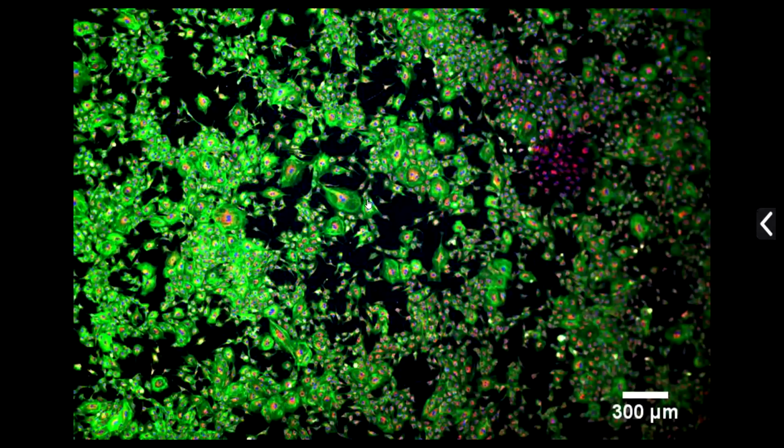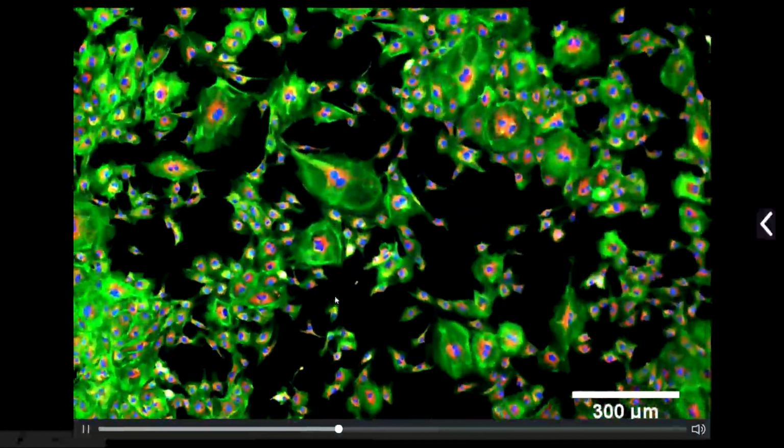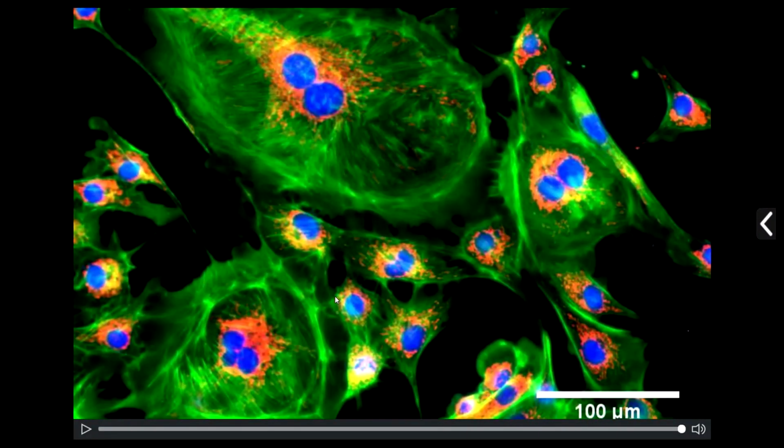The Mesolens is not a zoom lens, which means that unlike other stereo zoom systems where if you vary the magnification, you also change the numerical aperture, in the Mesolens, we don't. It's entirely fixed. We've always got that subcellular resolution. All I'm doing is showing you that through computational means here. So if we zoom in, we can see, for example, these cell nuclei are clearly resolved. We can see the bundles of F actin as part of the cell cytoskeleton, and we can see the bundles of mitochondria too.